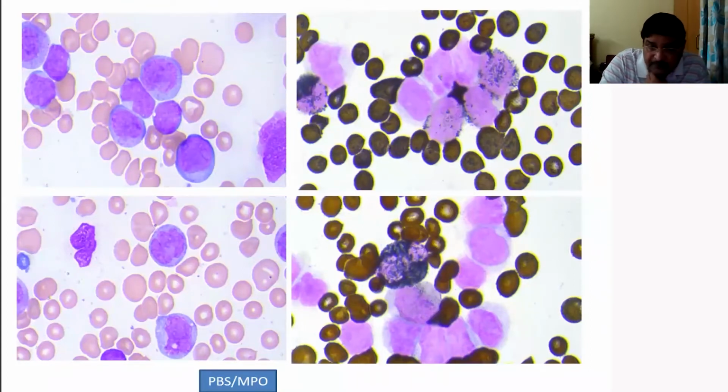Whereas many times what happens, the cytochemical MPO is plus minus, as it is in the lower outer quadrant. So flow cytometry is important. The morphology of these cells are classical blasts, but some blasts are a little variant in morphology. Some are with a lot of folds, some are monocytoid, some could be promyelocyte looking. So it is important that you look for the features on flow cytometry.